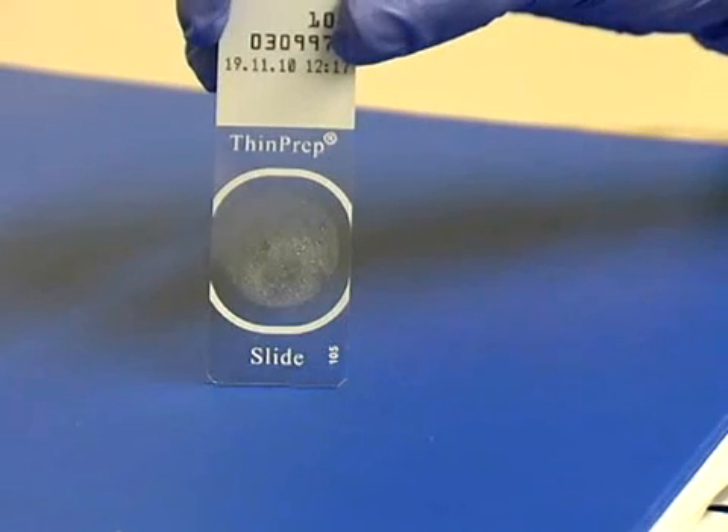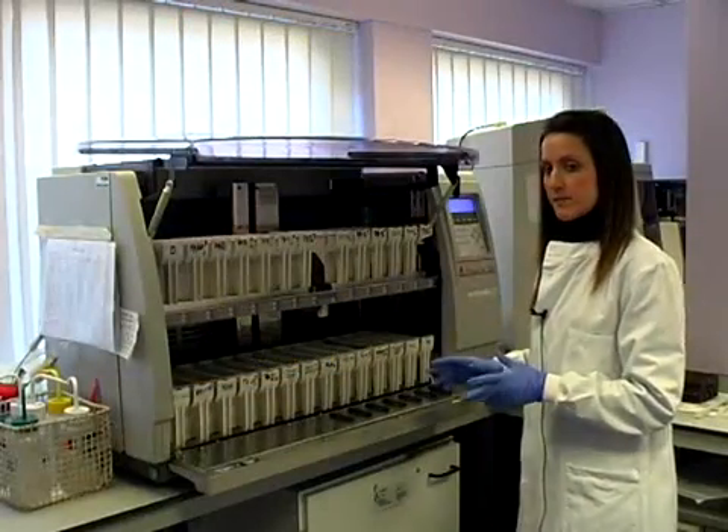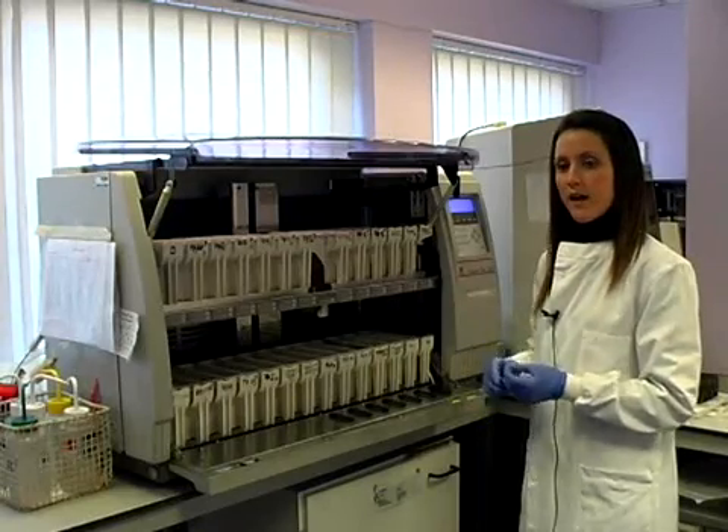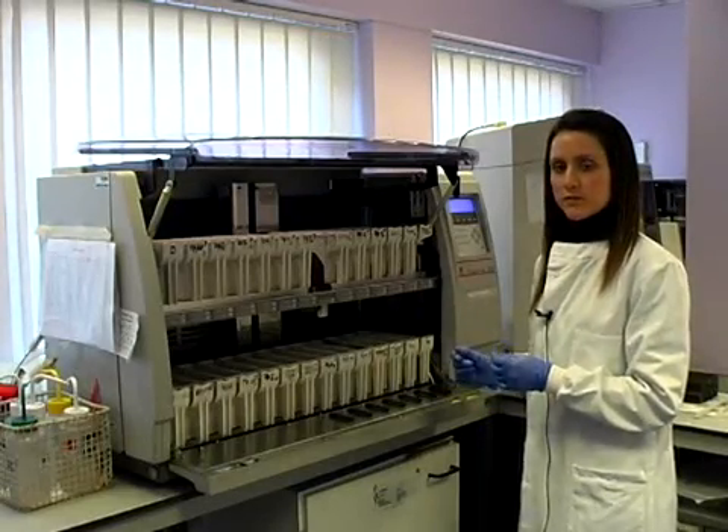This is what the slide looks like at the end. This is the staining machine, where the slides produced on the T3000 are then stained so that they can be screened.